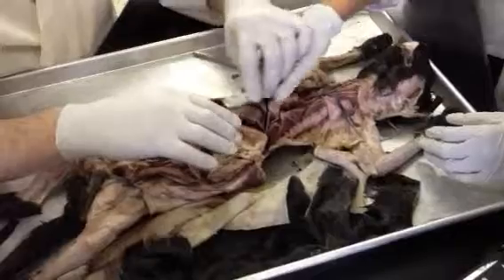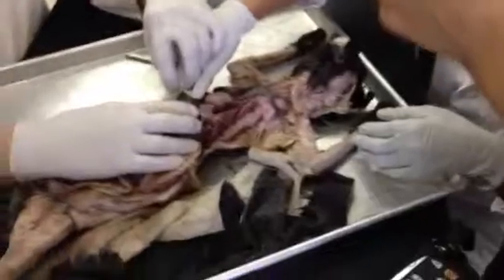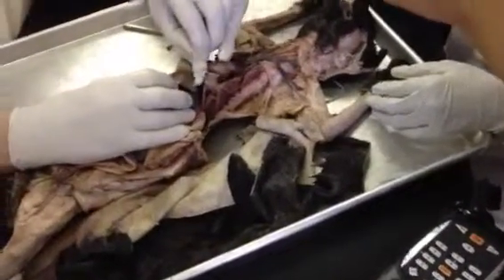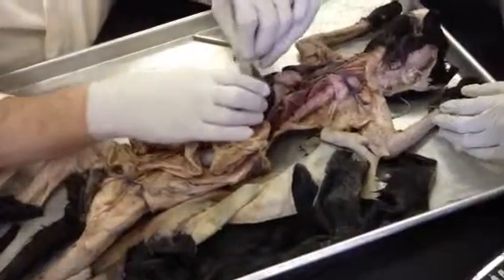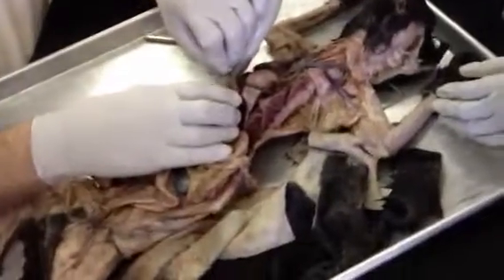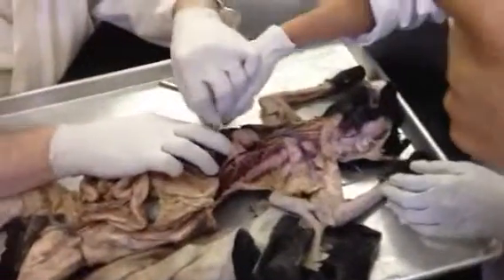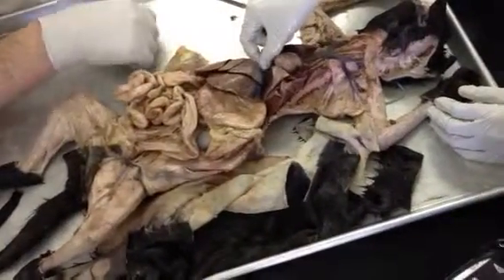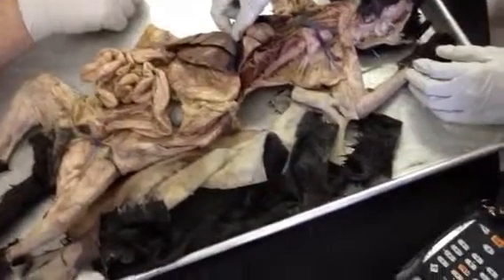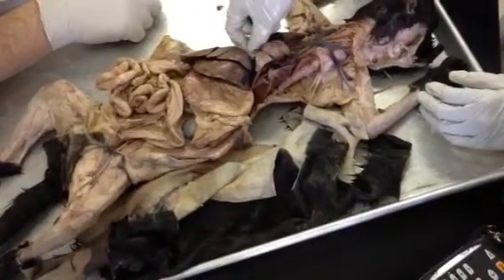So here's the liver again. All of that's liver. To refresh your memory, there is the gallbladder. Here's the superficial surface of the liver right there. Here's the liver again. This is the diaphragm muscle. There it is over there. And right here, there's a little patch, a little membrane right there. Can you feel that? Yeah. That's the falciform ligament right there. There's only one, and it anchors the liver to the diaphragm. That's its job. It connects the liver to the diaphragm. Got it?